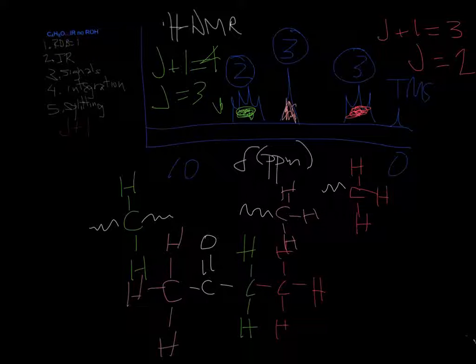This time, I'm going to give you the compound, and we're going to do the spectrum. That's a benzene ring.